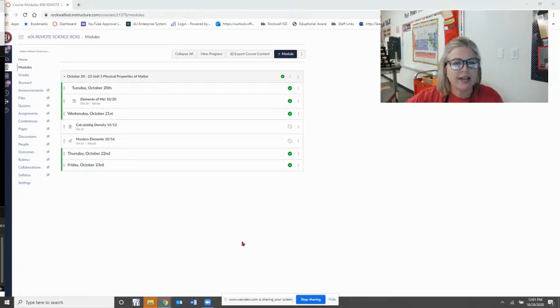Hi, boys and girls. Today in science, you are going to be identifying some mystery elements. You're going to determine the identity of an element by calculating its density.